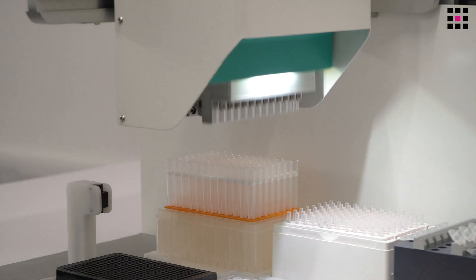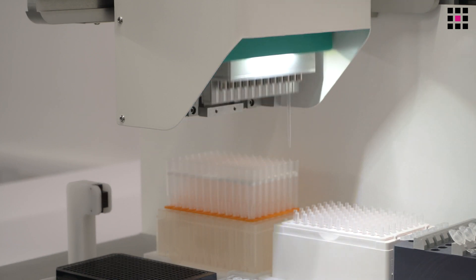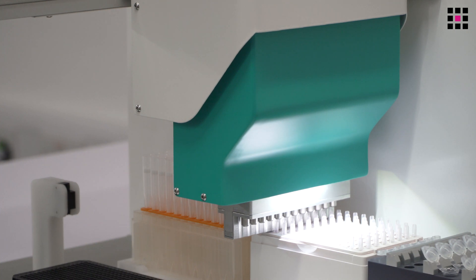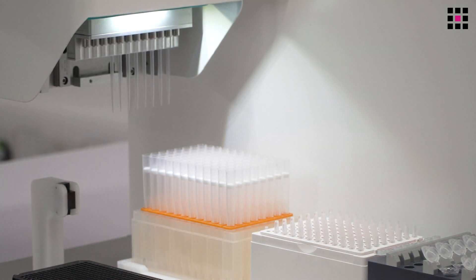The flexibility doesn't just come from high and low volume pipetting. The instrument can also flexibly pick up either a single tip — as we've done now — which is useful to aliquot from single tubes into plates or strips of PCR tubes. It can also pick up a strip of tips to aliquot from tubes into plates or to copy samples from one plate to another.